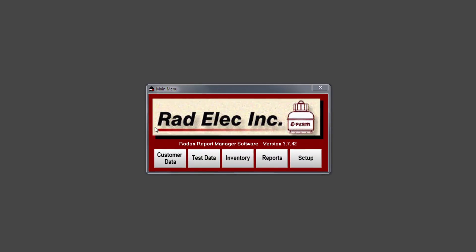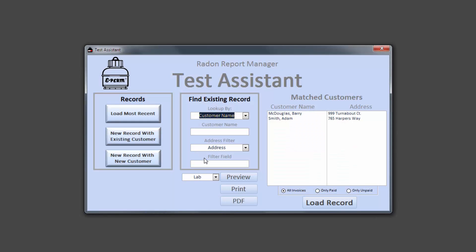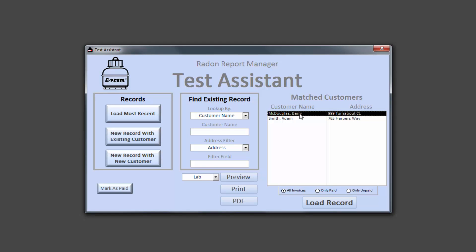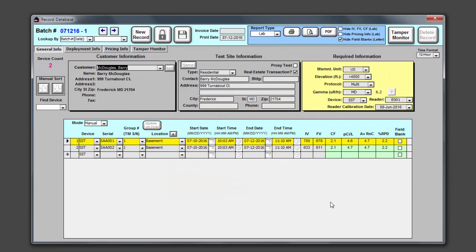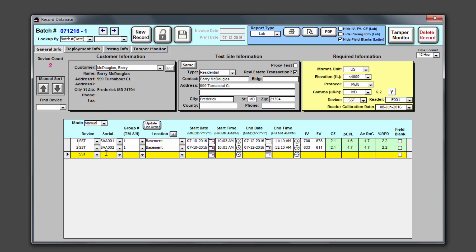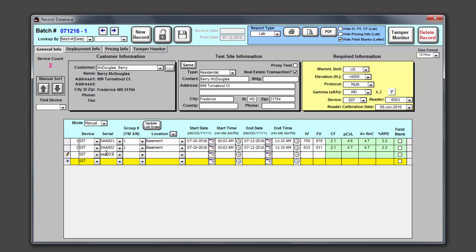Now that we have the theory down, let's put this into practice and walk through a blank deployment from within the Radon Report Manager software. Let's load up a previous record that we've already created. This test record only has two detectors deployed as a co-located pair within the same group, so let's add a field blank here. After the record is finished loading, let's start off by unlocking it, then moving down to the data entry window and typing in a new serial number. Because we'll be putting this blank into the same group as our other two detectors, let's enter in the same box number. As soon as we do that, a bunch of our information gets filled in automatically, such as our locations and our start and end dates and times. We then tap through the data fields and enter in our initial and final voltages, assuming we've already concluded the test and have all of this data in front of us.